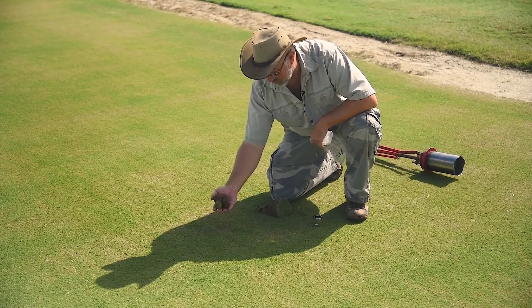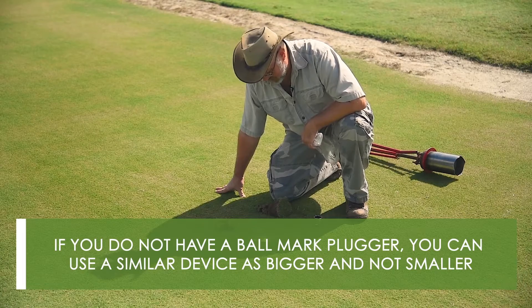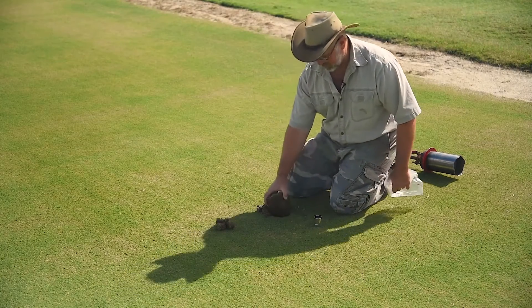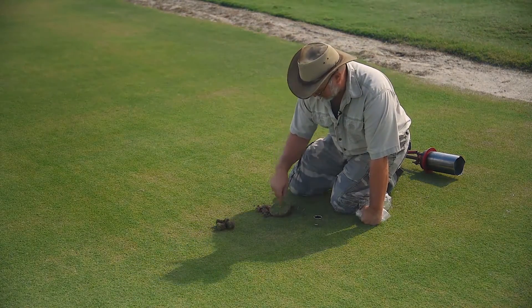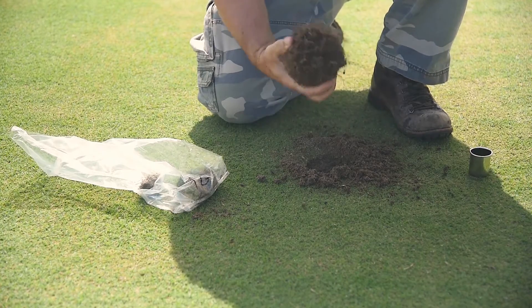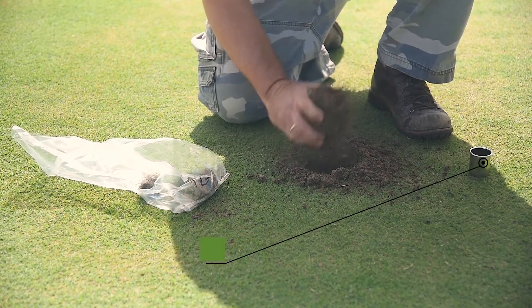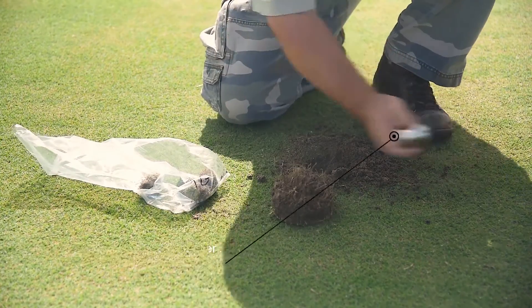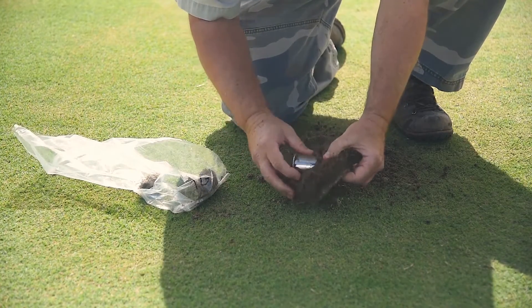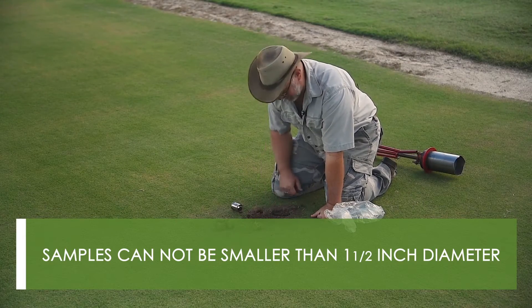We're using nematodes per four turf plugs. Now, if you don't have a ball mark plugger that's exactly an inch-and-a-half in diameter, that's okay as long as you use a device that's bigger and not smaller. For example, some of you may want to send us samples from a cup cutter. We would take four cups and knock the soil off, because you don't want to be shipping a bunch of soil and we're not extracting nematodes from soil — we're extracting from these roots. In the lab, we have an inch-and-a-half diameter cookie cutter that we use to cut out our inch-and-a-half diameter plug. So it's okay if the samples are bigger than an inch-and-a-half diameter, but they can't be smaller.